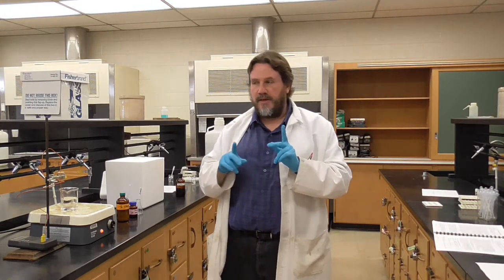So as we change the temperature or as we change the pH, what we're doing is we're affecting the enzyme, again called amylase, its ability to catalyze the breakdown of starch. And we will see the evidence of it by the color.